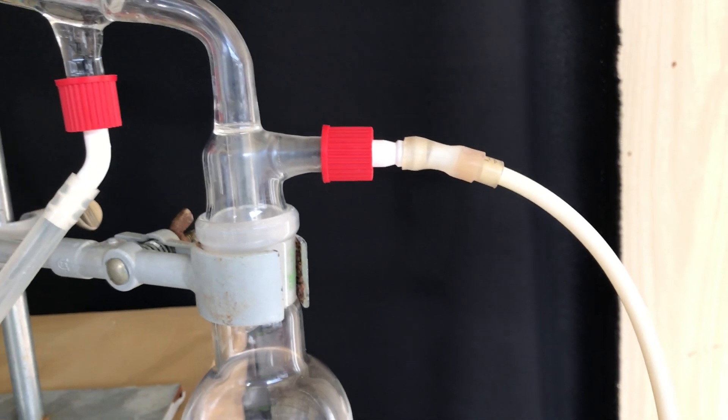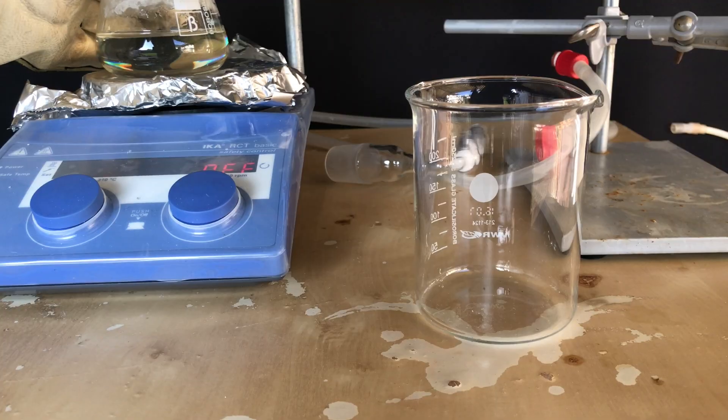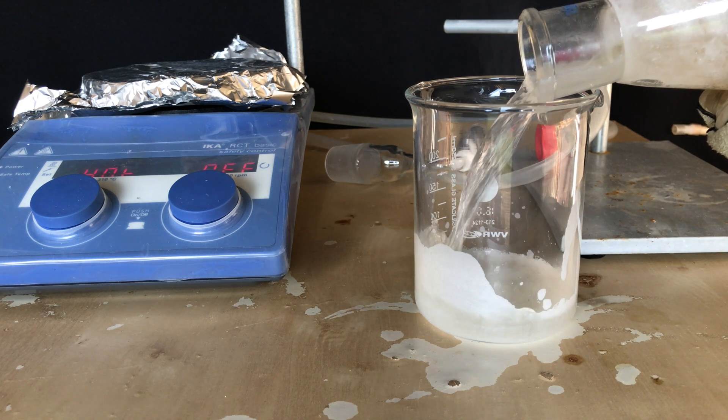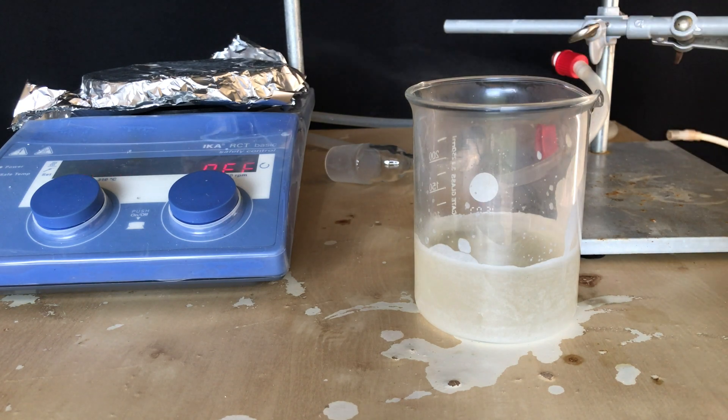After half an hour I noticed that something was terribly wrong. A lot of hydrogen chloride was generated and leaving the apparatus, and we collected this much liquid. For this reason I stopped the entire process, because something was going wrong and we are not ending up with any product. Whatever these leftovers were, I put them into a beaker and let them cool down. It turned into a solid block.